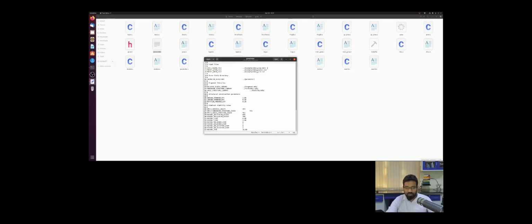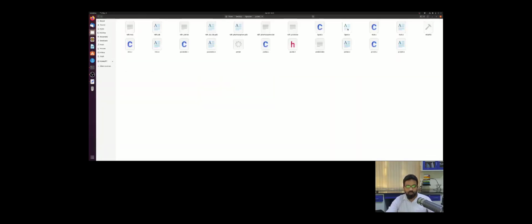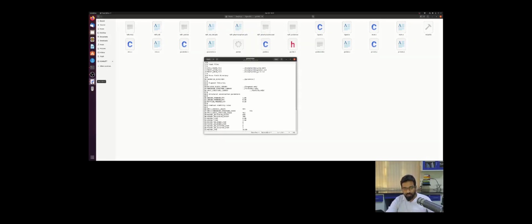We got some output files in the previous step. One is pocket.txt, another one is grid.txt. If we look at those 2 files in the pocket folder, the output from the previous step, the file names are 4dfr pharmacophore.txt and 4dfr pocket.txt.